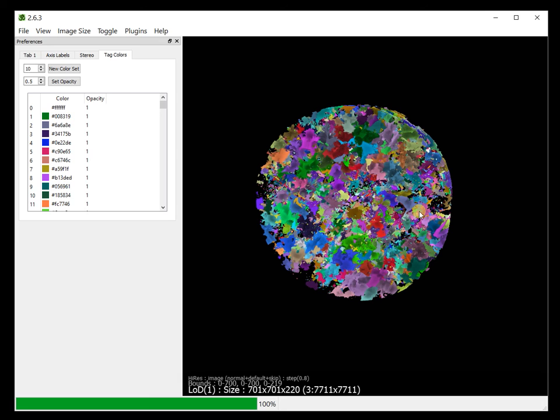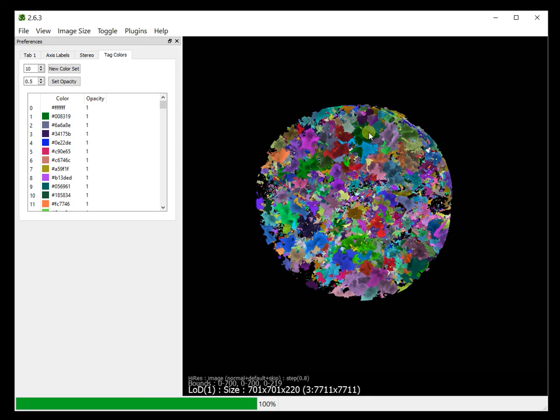Whether it is 8-bit or 16-bit, you would be able to use the random colors for, say, for example, showing the pores or the grain data. Especially for rocks, this is pretty useful.